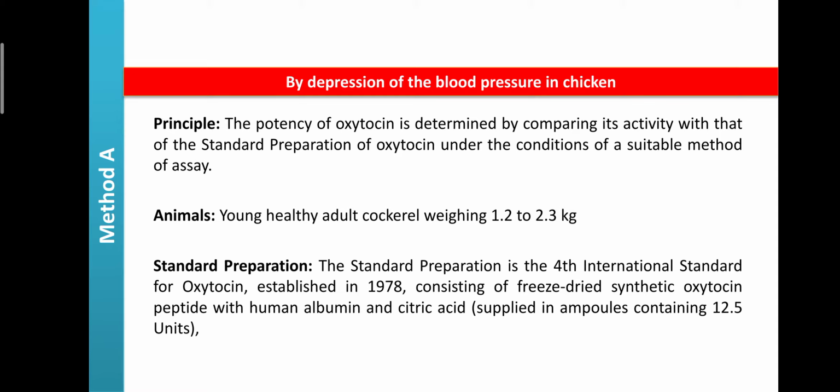Later on you can make two dilutions. As per your convenience, you can make one dilution of 1 unit and a second of 2 units, or as per your need or your study, you can make the units for the study.